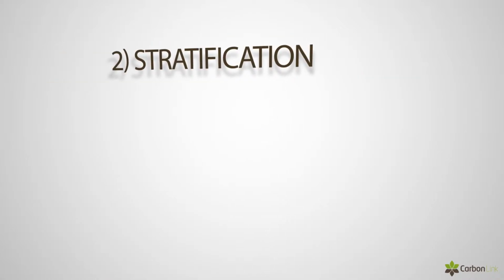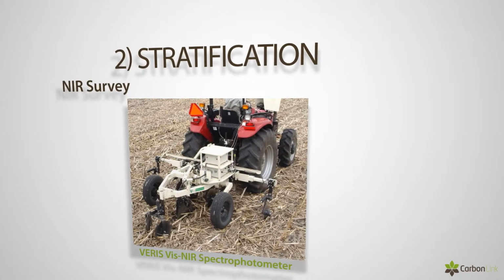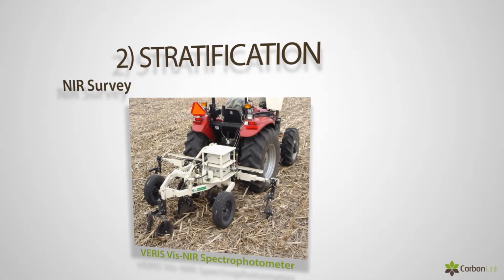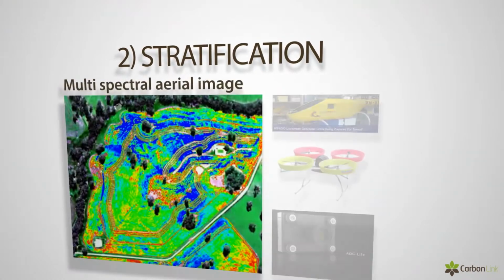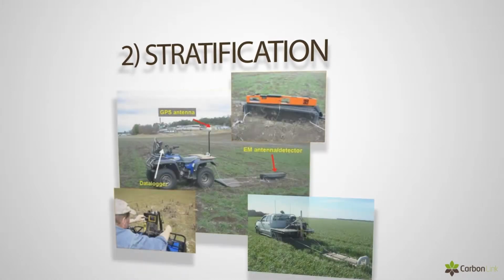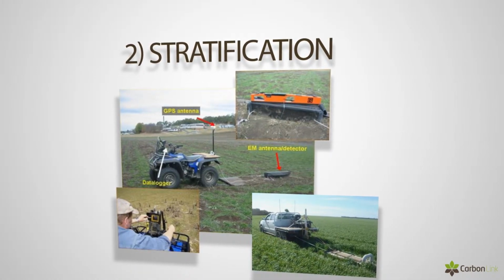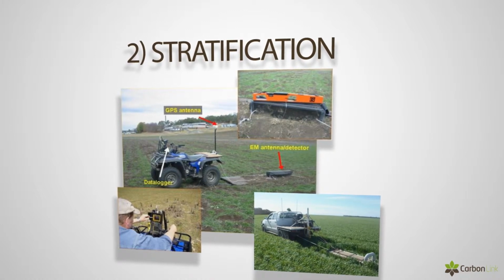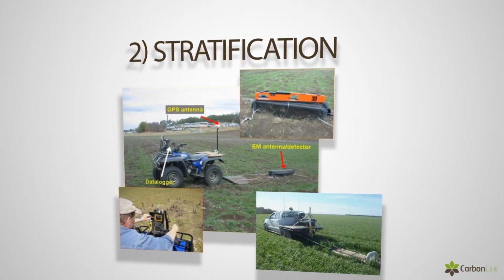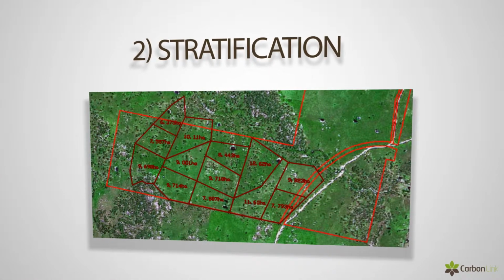So this is an American instrument which really doesn't work too well on Australian soils. We're doing some work on looking at aerial mapping, but we've got a bit to go with that. It can also be done from the ground using a number of instruments, some of which you can see in the photographs on the screen. So the step is then to use various instruments to look at the variability on the property or in the paddocks in which we're measuring.